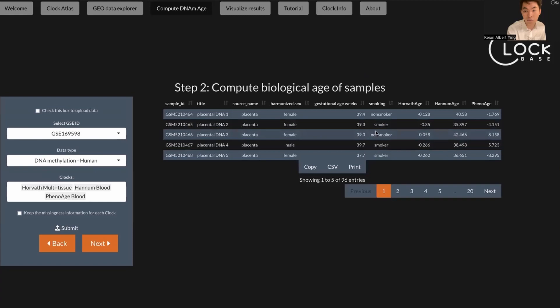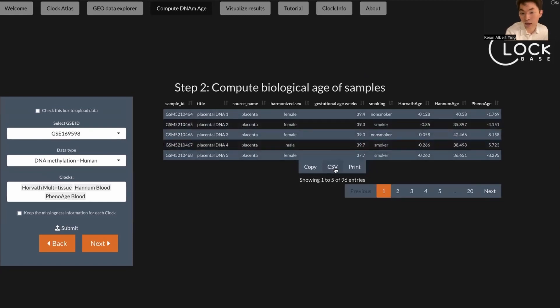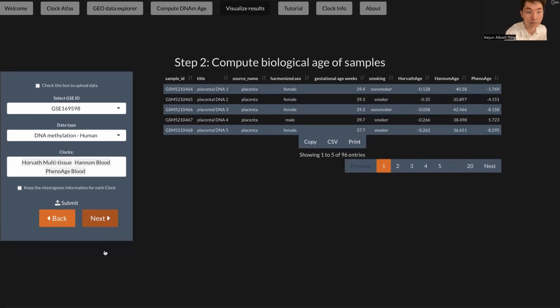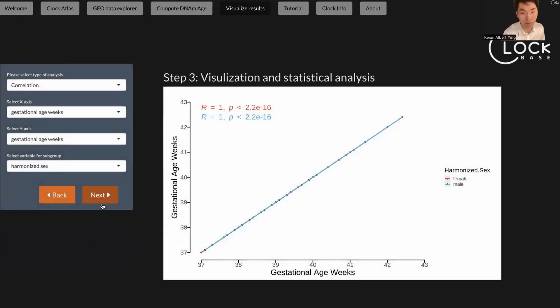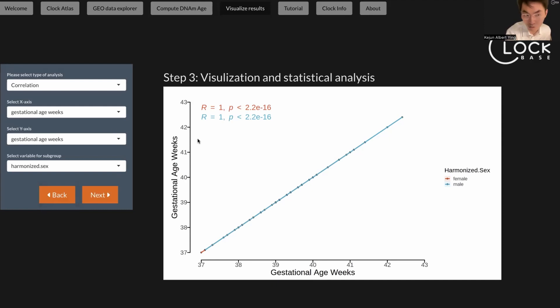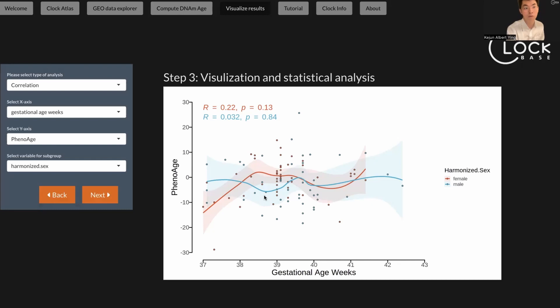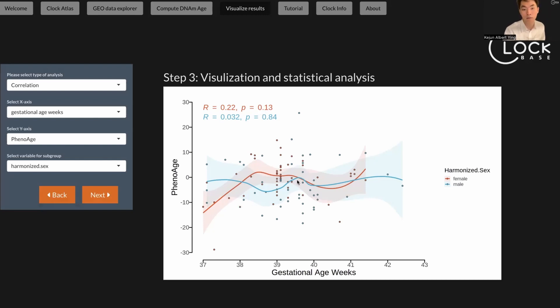Once we have the biological age available here, you can either just download this table by clicking this button here, or you can use our online visualization tool to do the analysis. Here I'm going to show you how to do it. Just click next step and the first thing you can do is a correlation analysis. Here is just a default column which selects the first numerical column in the table. It usually doesn't mean anything, but you can choose the column you want to analyze. For example, if we want to analyze the correlation between the gestational age and the phenol age measurement, you can see it will give you a correlation analysis. It shows the Pearson's R and the P value, and they also fit a LOESS curve to show the trajectory of your data.